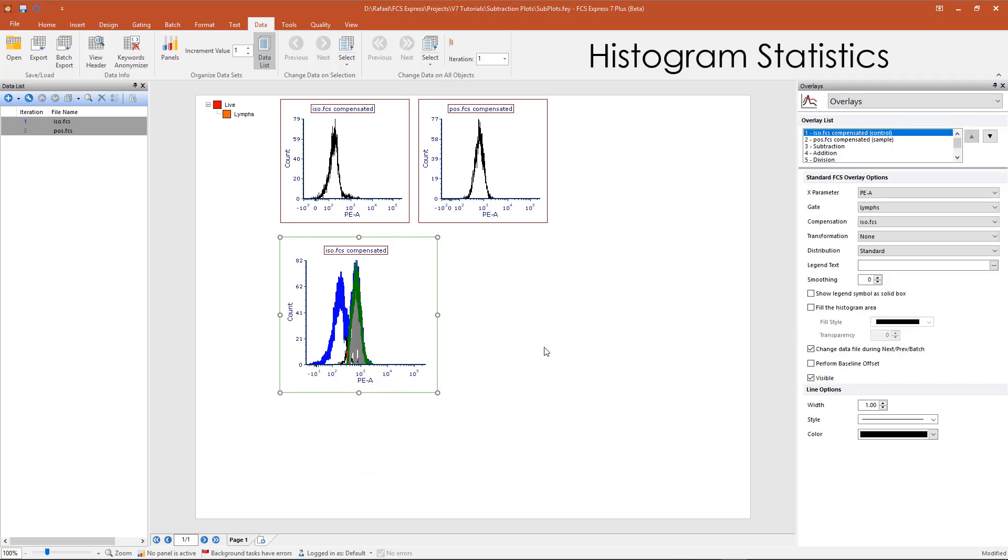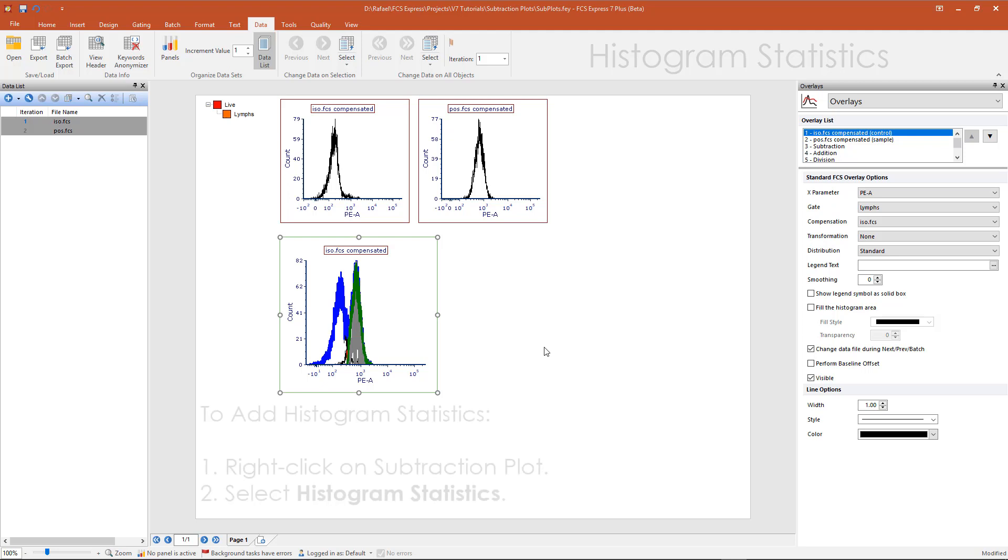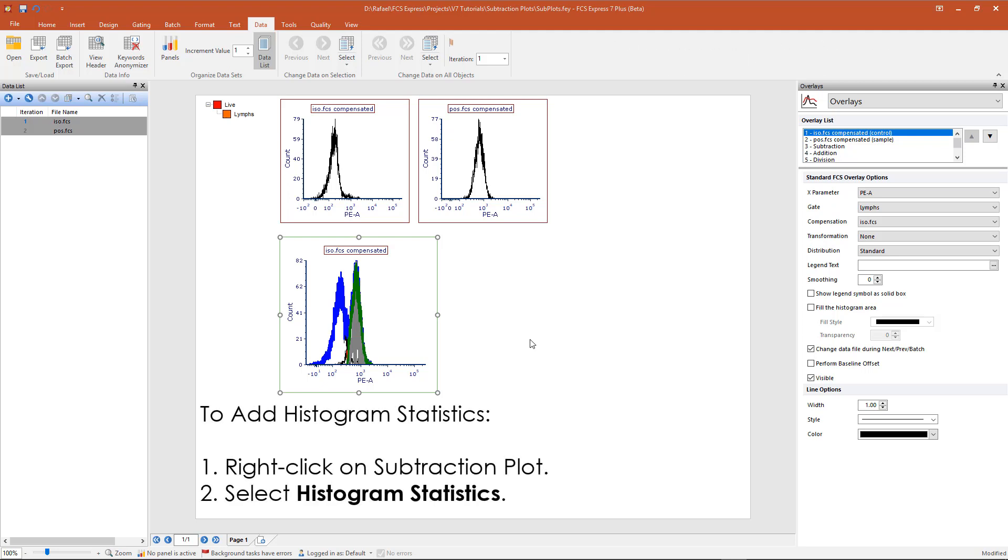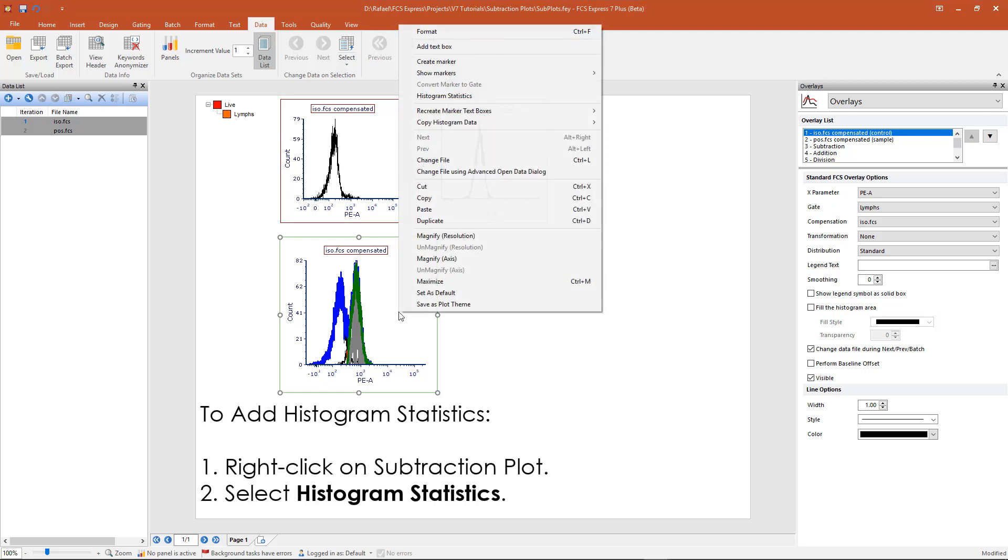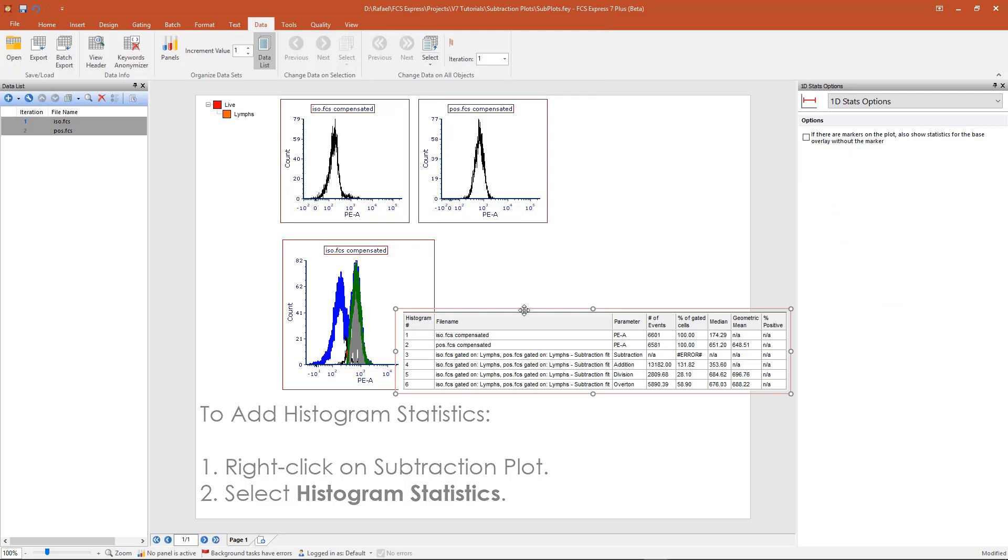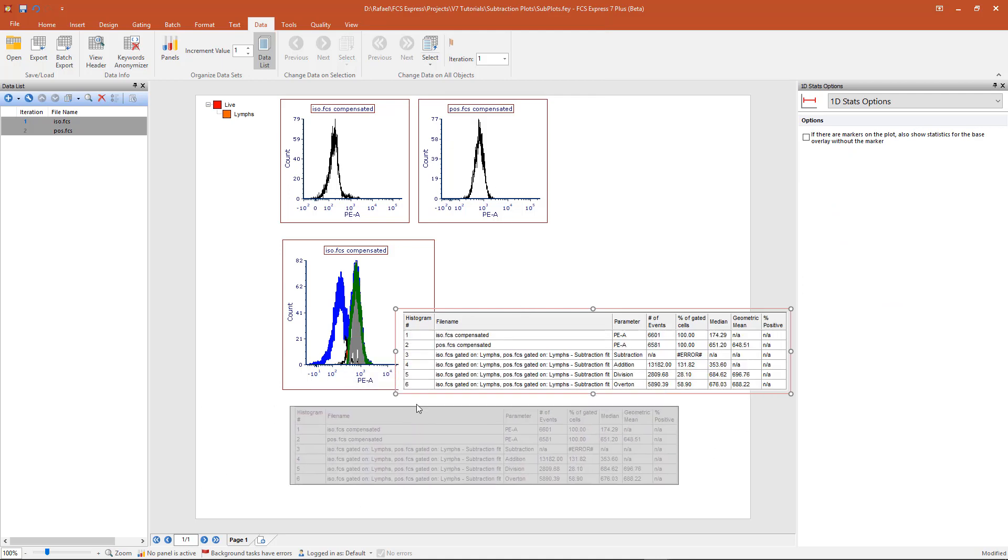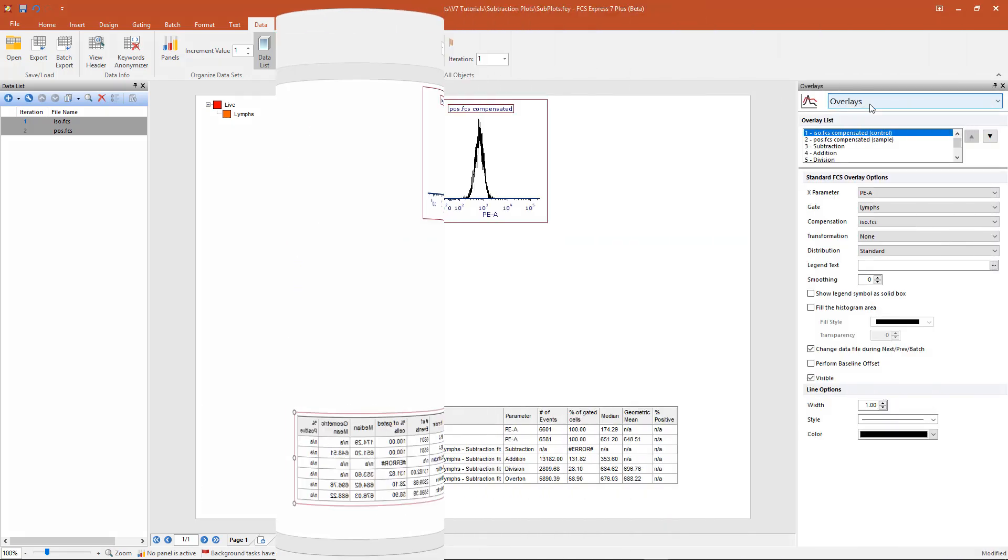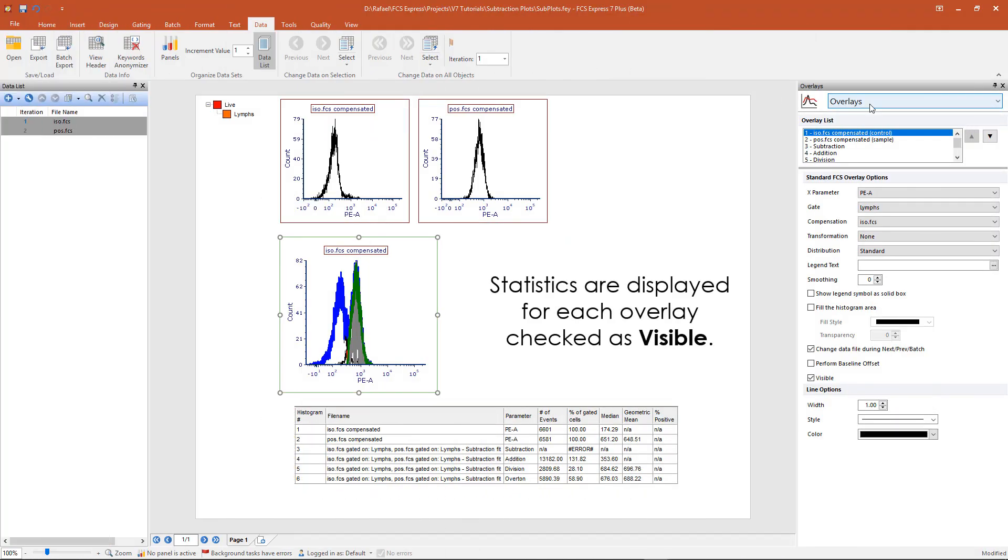Histogram statistics are automatically calculated for subtraction plots and can be accessed by right clicking on the plot and selecting histogram. Statistics will appear for each overlay that is checked as visible in the overlays formatting window.